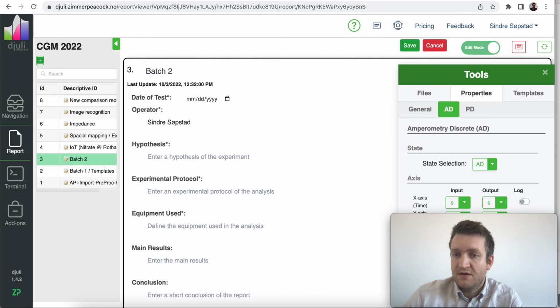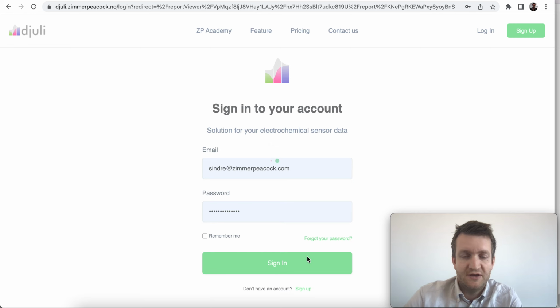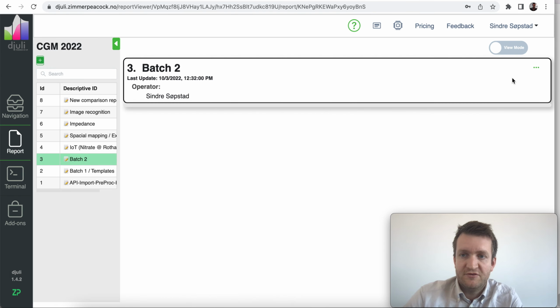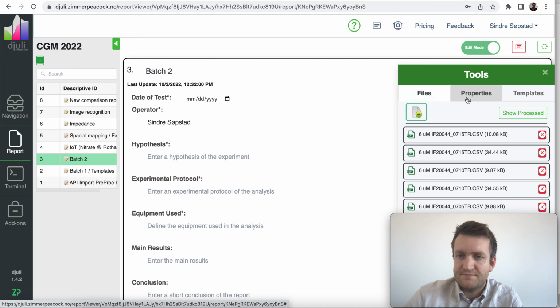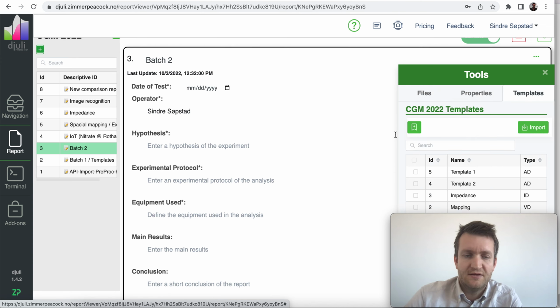Okay, so let's actually make a new report. I have to sign in again because my session expired. It would take me back to this report, which I hadn't saved, so it doesn't actually have any study now, any settings, nothing.